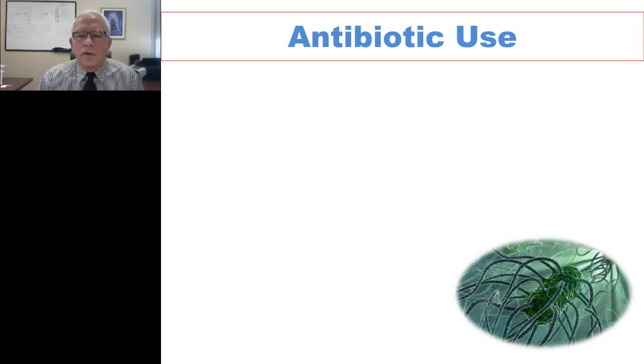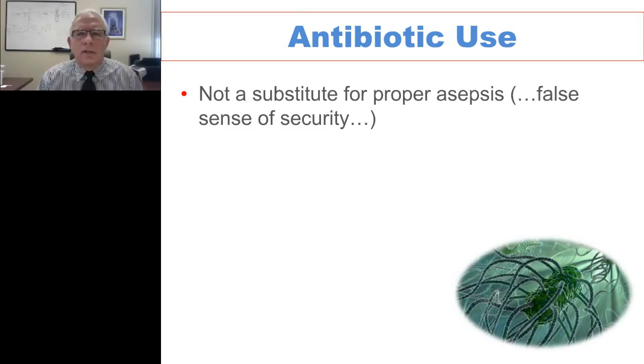So antibiotic use. You have all dealt with investigators who say that for everything they do, let's give them an antibiotic. Is that a good practice? First of all, it should not be used as a substitute for proper asepsis. It is so common. I've seen it. I mean, I've been in business for many years now. I've seen it commonly. The investigator wants to use antibiotics for everything.